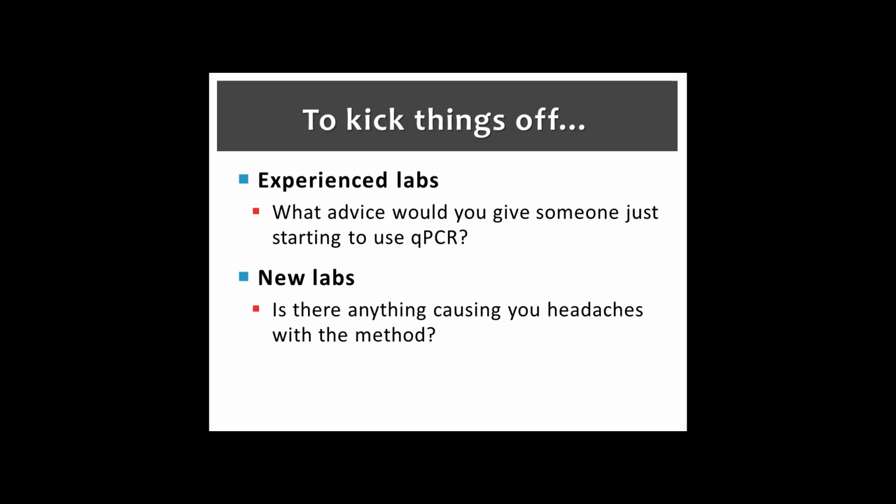And a comment from Rich. This sort of gets to the question that was raised earlier about what the limit of detection of the method is.